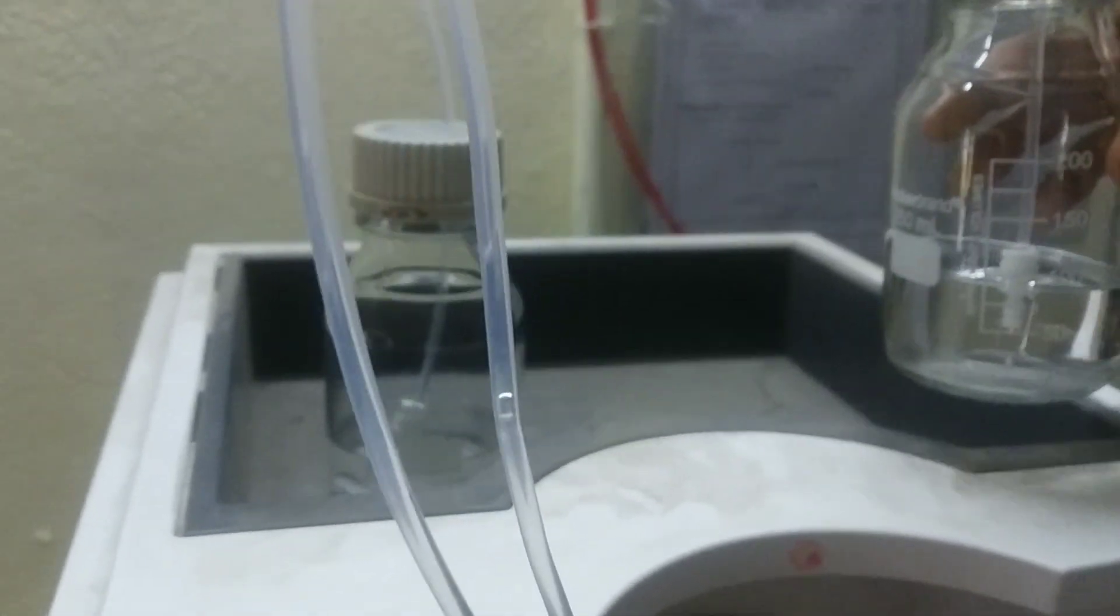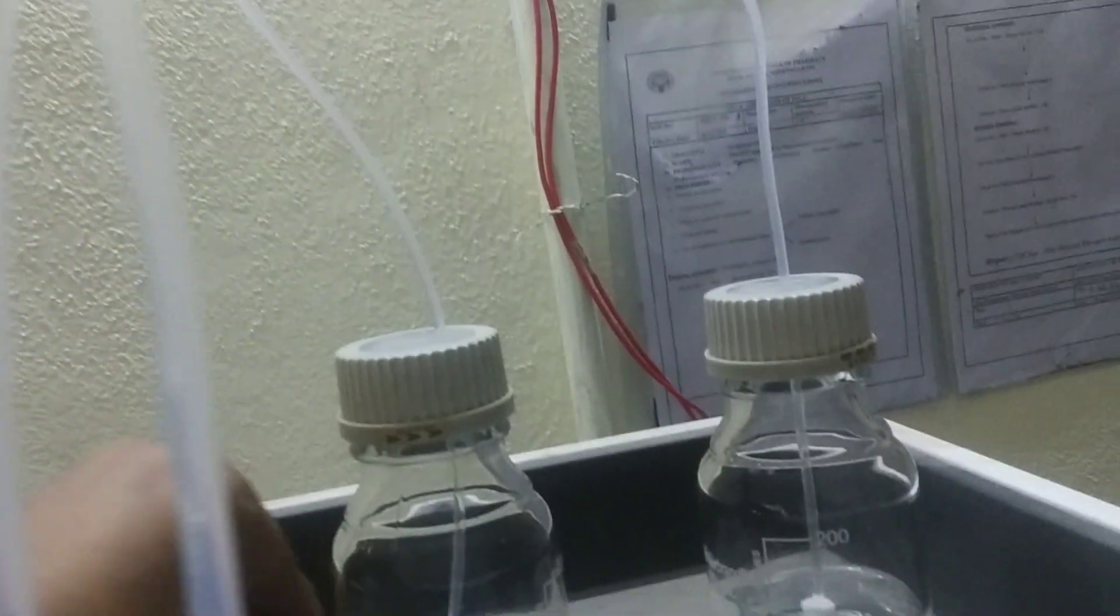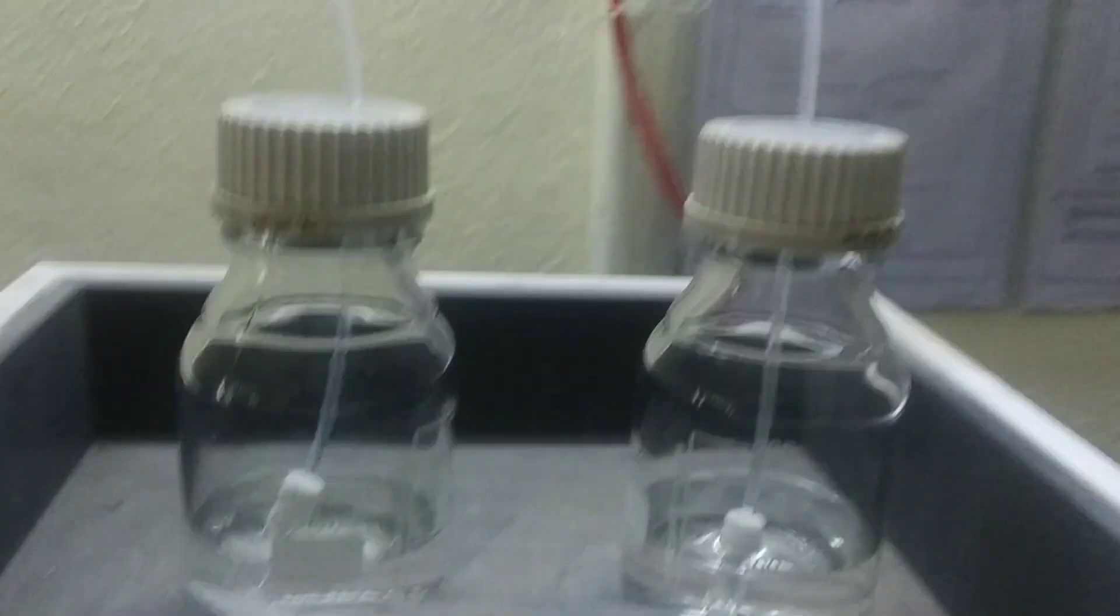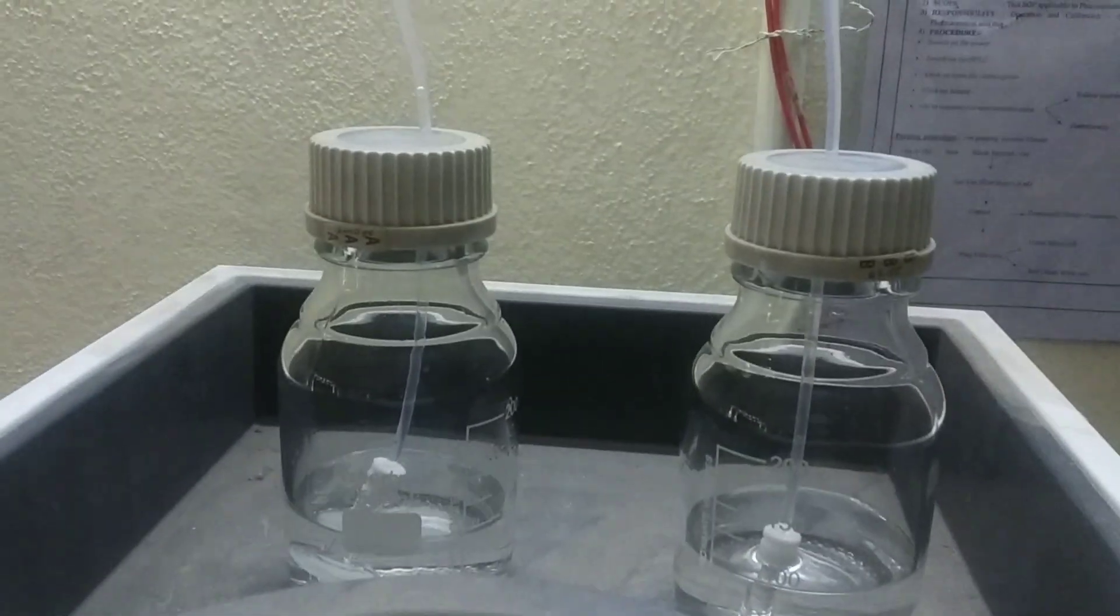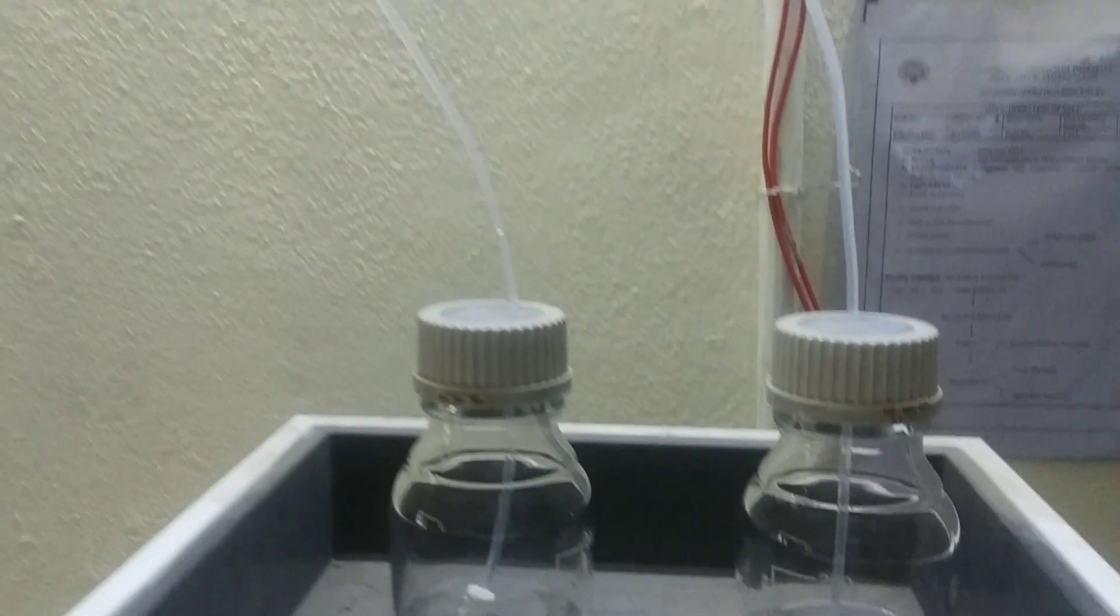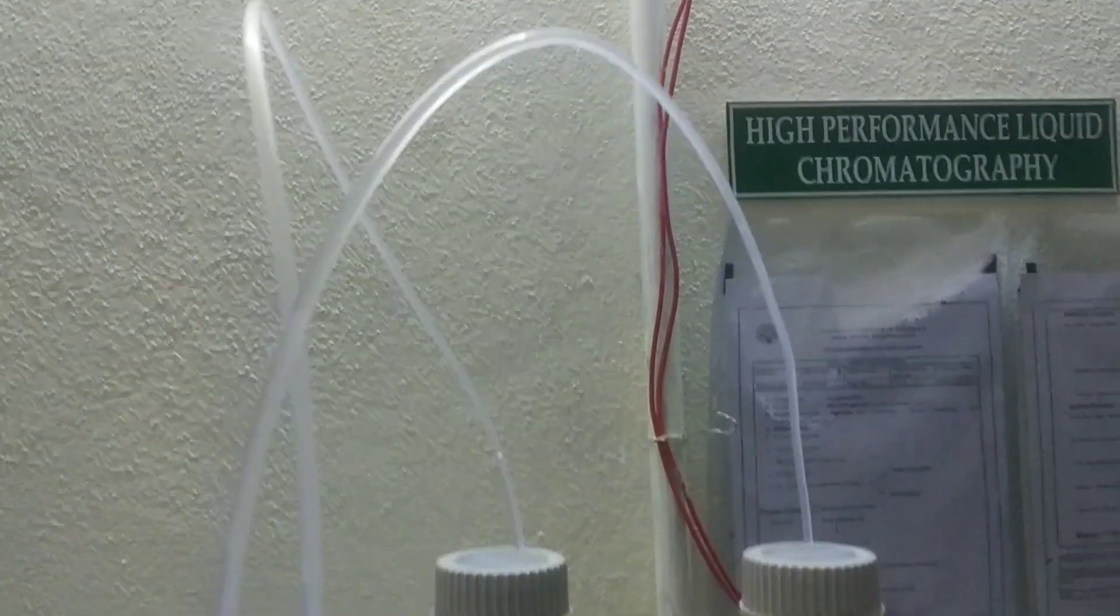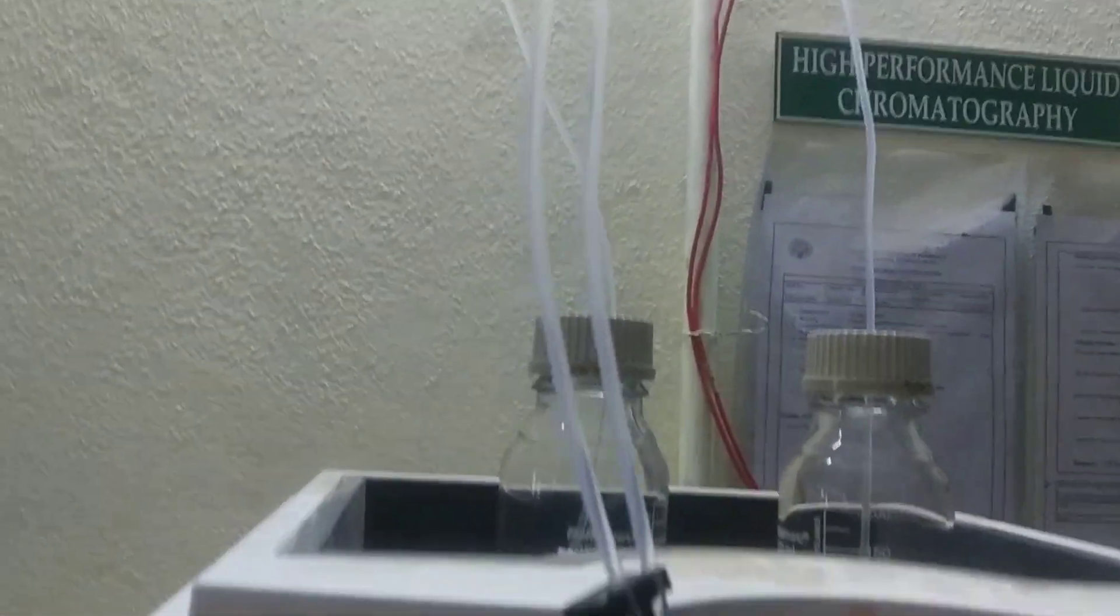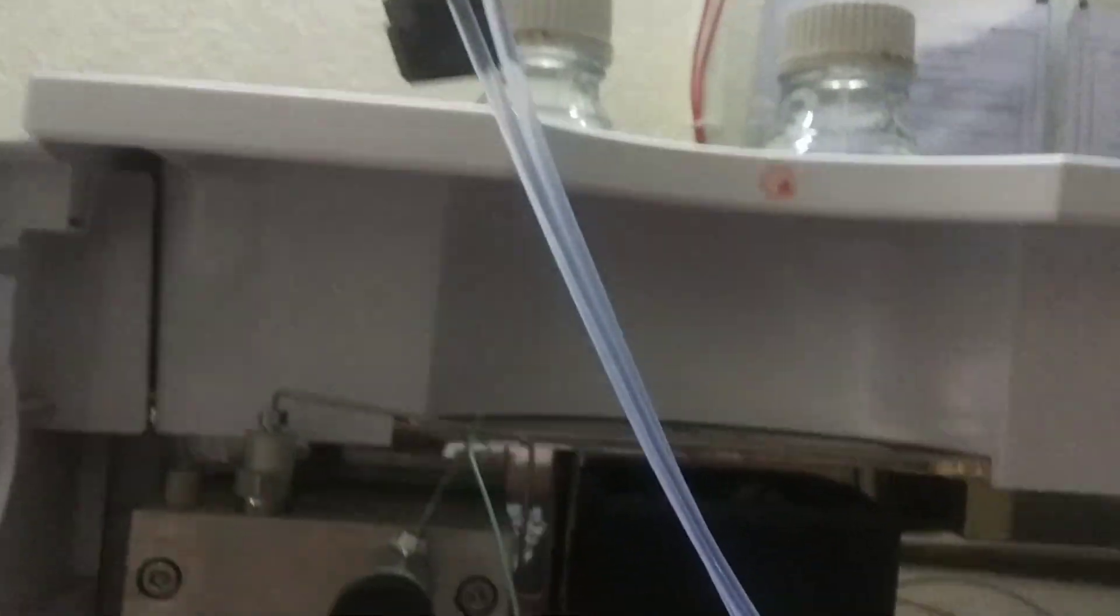Here you can repeat the washing with 100 percent HPLC grade water and then 100 percent HPLC grade methanol with slight increments in the flow rates. You can continue each process for about 15 to 20 minutes. Now I have switched to the new combination of mobile phase: methanol and isopropyl alcohol.